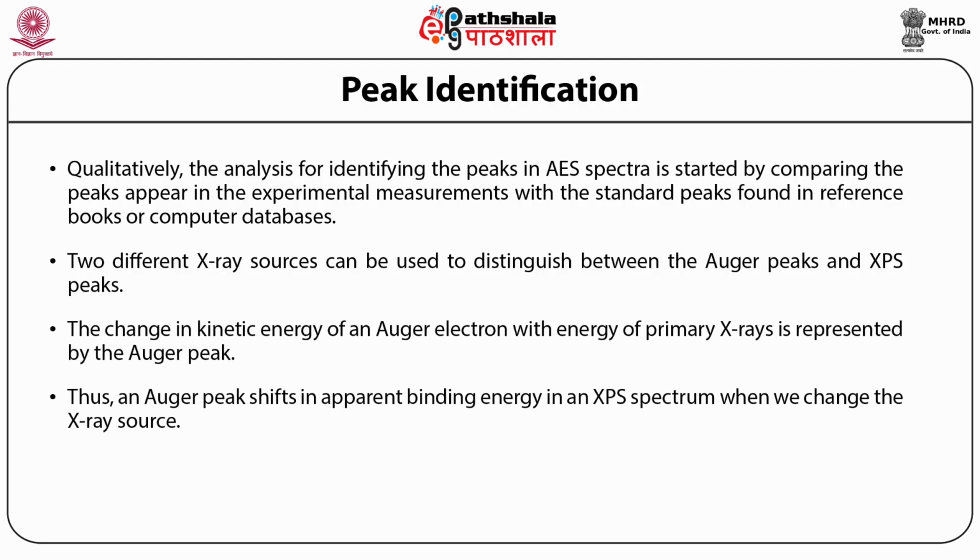Thus, an Auger peak shifts in apparent binding energy in an XPS spectrum when we change the X-ray source.